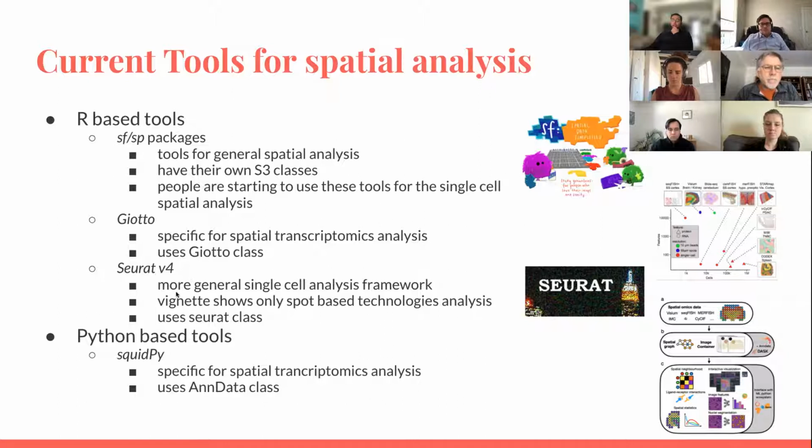While Seurat, that probably everyone knows, is a more general framework for the single cell analysis, and they showed how to analyze spatial technologies, but their vignette is focused mostly on the spot-based. They have examples with the 10x Visium and with the Slide-seq data.